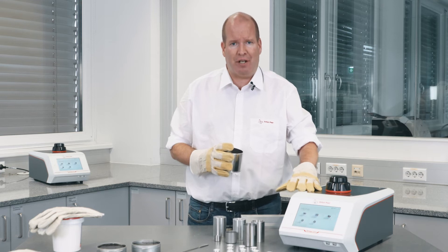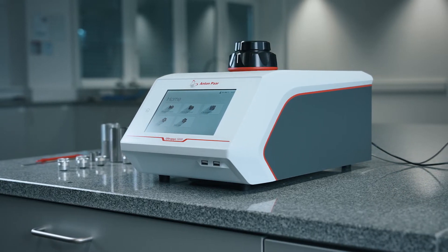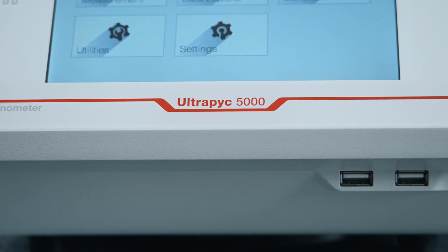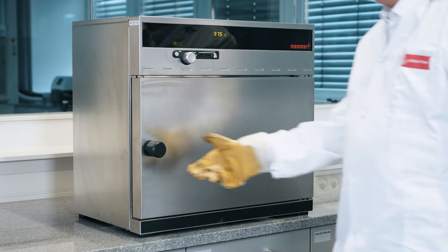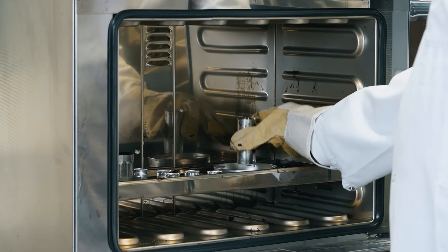The Ultrapyc 5000 measures the density of asphalt, bitumen, pitch, or any other petroleum-based viscous and sticky material with ease. Whether you use hot mix asphalt or break off a piece of solid bitumen, with wide measuring cups, transferring or loading the sample is straightforward.